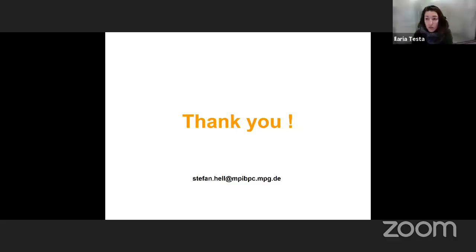Yeah. All right. So I'll read you the question in the chat. Another thing that may help also clarify the method, because the concept is new. So people, of course, always try to refer to what has been around for a while. So in PALM and STORM, like in localization in general, it's a must to have one molecule in order to gain resolution. So we can't work with double events. They are usually discarded with different types of filters. In MINFLUX, what happens if two molecules pop up at the same time?